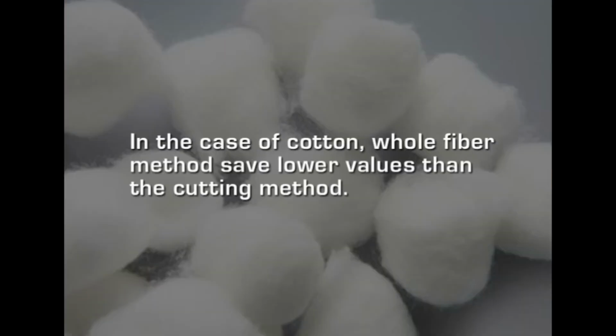In the cutting method, 1 cm lengths are cut from the middle portion of the bunch of fibers after fibers are straightened out. If the central portion weighs more per unit length than the end portion, which is typical of cotton fibers, the result given by the cutting method will be higher, and if it weighs less, the result will be lower. It was observed that in case of cotton, whole fiber method gives lower values than the cutting method.